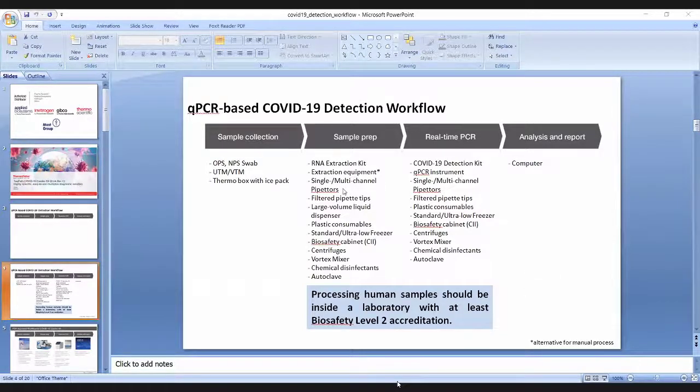And since we are also dealing with Kingfisher, right? Kingfisher is an instrument that offers you a high throughput. So ibig sabihin, madaming samples yung mapaprocess nyo in just one run. Now, because the instrument is not fully automated, there are steps in your Kingfisher that need manual dispensing of the reagents into the plates.